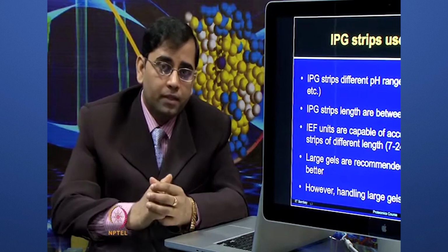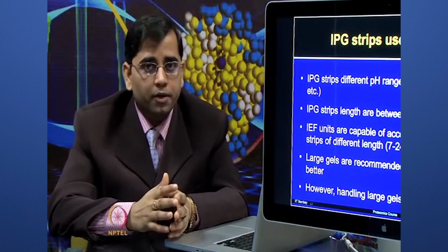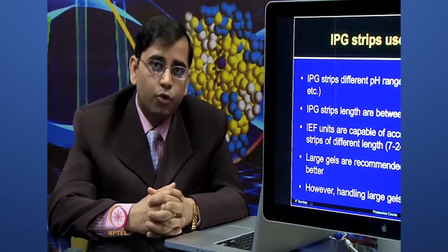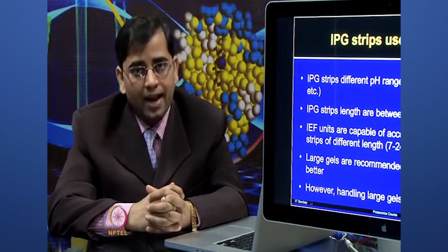But overall, large gels are recommended for doing any type of differential proteomic analysis, when you want to compare your control and treatment spots.